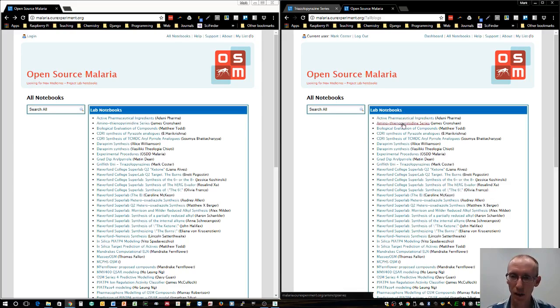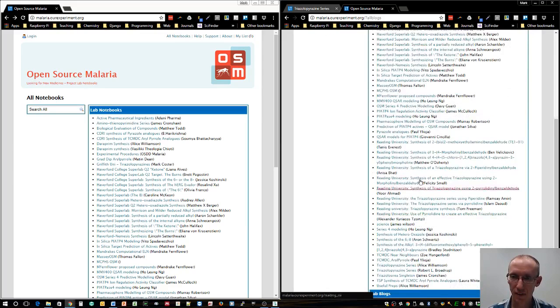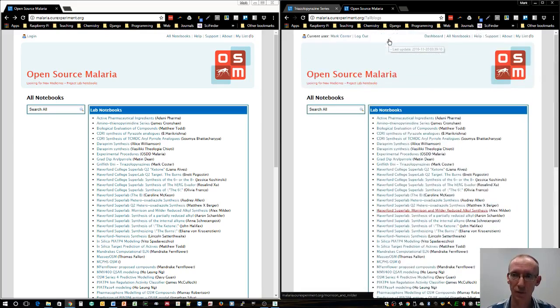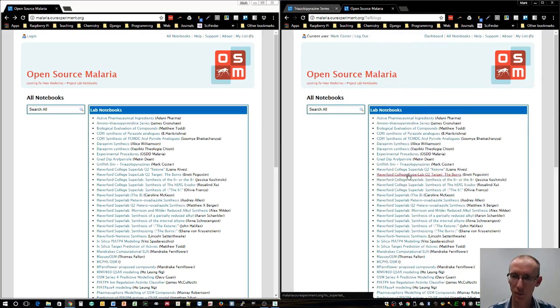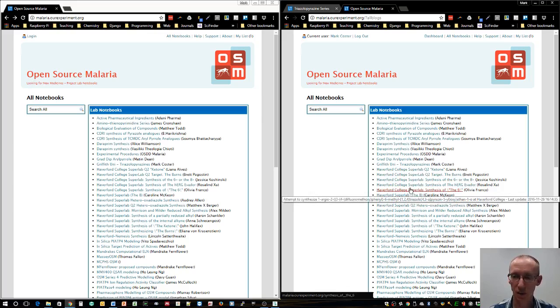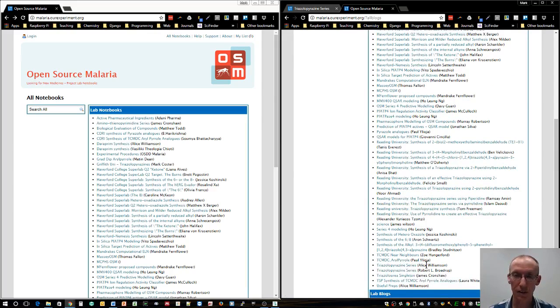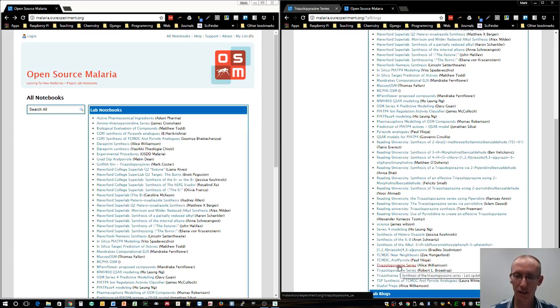If you click on all notebooks up here, you'll see all the notebooks that have been set up by various people around the world working on this initiative. There are a few groups that have done a lot of work, like the Haverford group and groups at Sydney University.